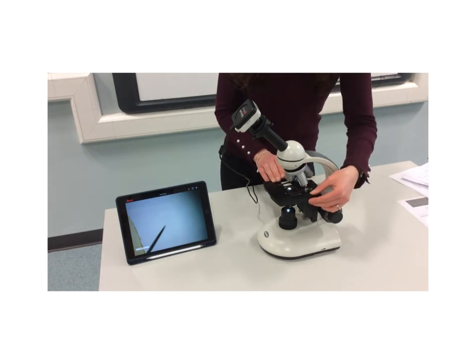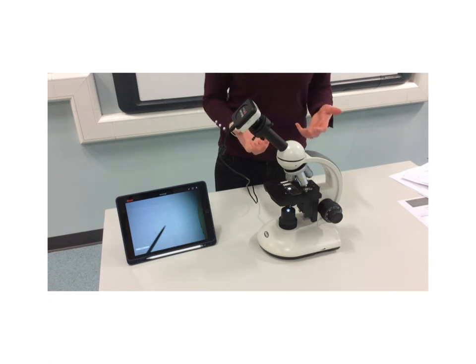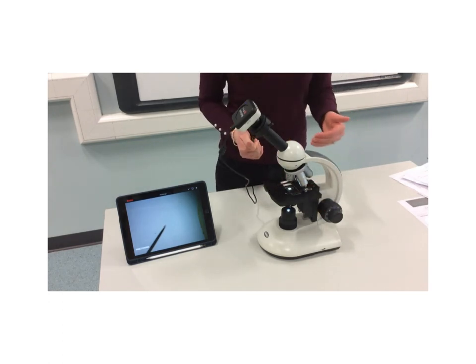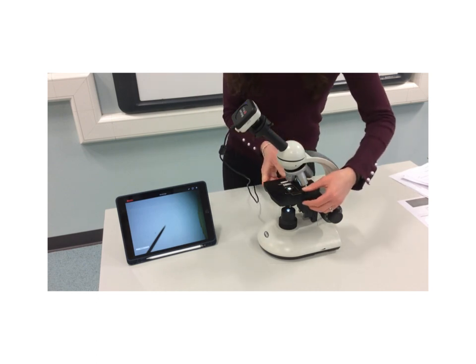The next one in your notes is what happens when you move the slide to the left. If I move it now to the left, I'll try to do that as slowly as I can so you can see. I'm moving it to the left. What's happening to the image? Which direction is it moving? It's moving to the right. So when we move the slide to the left, the image moves to the right.